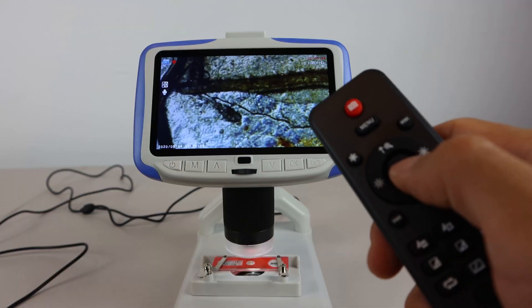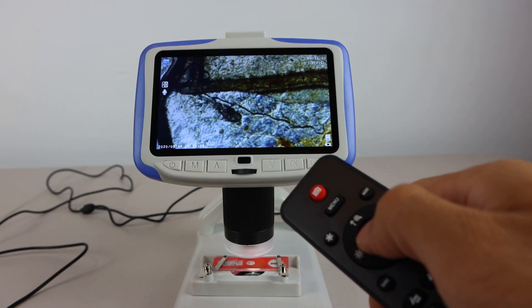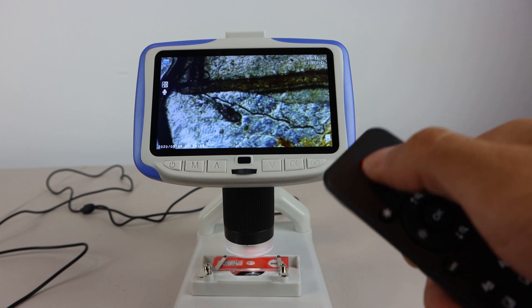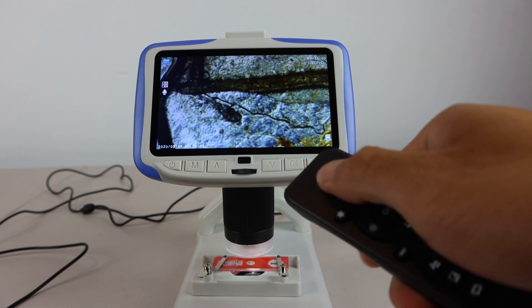The same is true for the remote control. To start or stop recording, press the OK button. The red photo button at the top of the remote doesn't do anything.